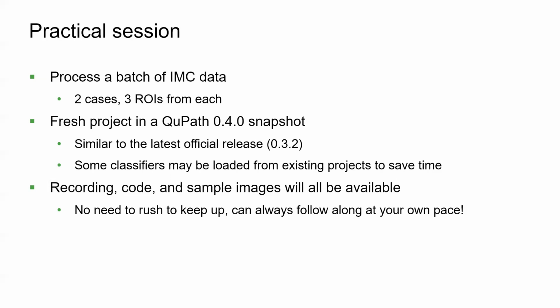It's also worth noting that the machine I'm running at the moment has 120 gigabytes of RAM with 32 threads of a processor. So things might go a lot faster than they would on, say, a laptop. But coincidentally, it actually does work on a laptop. I've been able to replicate this pipeline on my old 5-year-old Alienware laptop. So there isn't any kind of computational necessity requiring execution of this pipeline. Yeah, so on that note, let's begin the practical session.